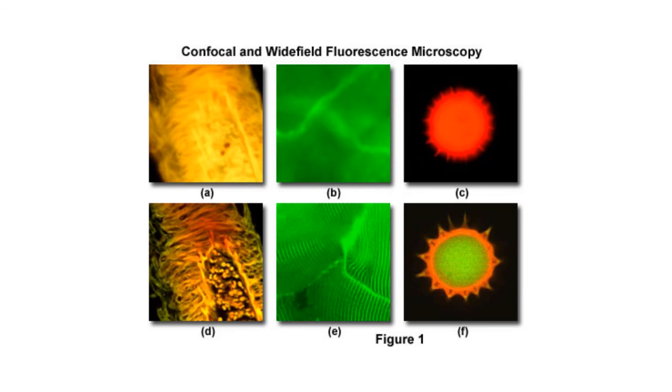In this manner, confocal microscopy is used to produce better quality images, and it could be coupled to fluorescence imaging as well. And by taking images in many different planes of the specimen by using computer assisted software, those images could be put together to produce a three-dimensional image of the specimen.